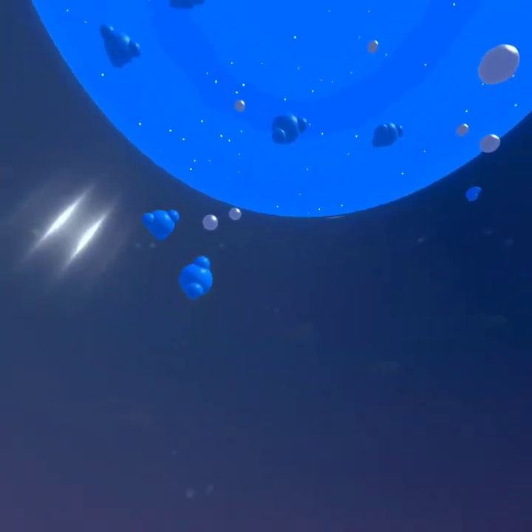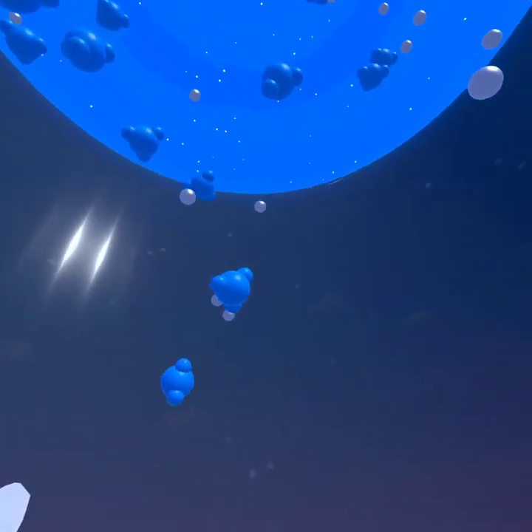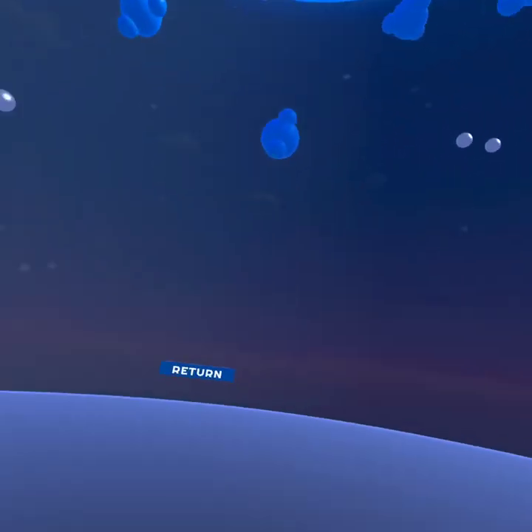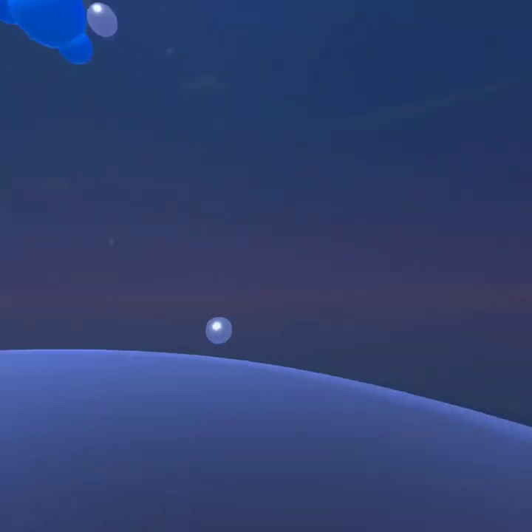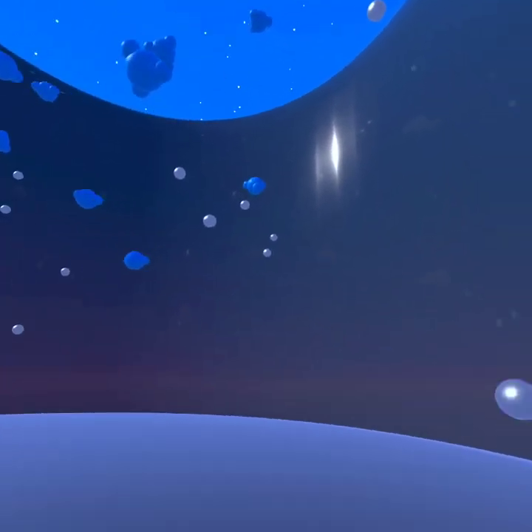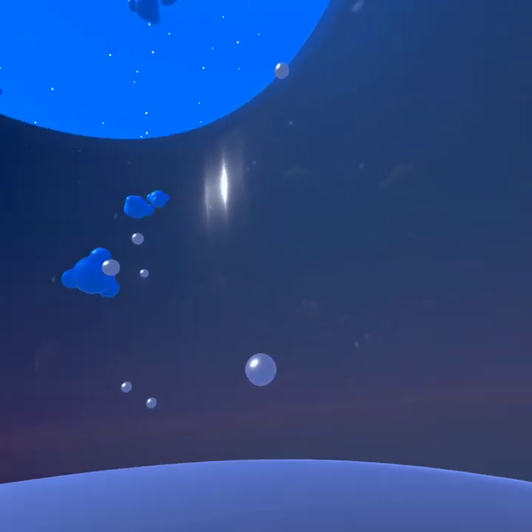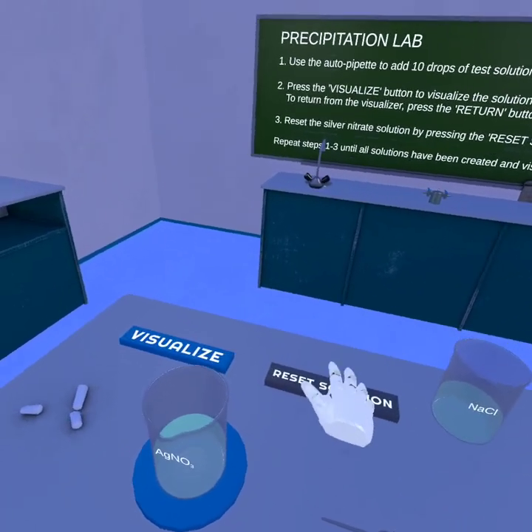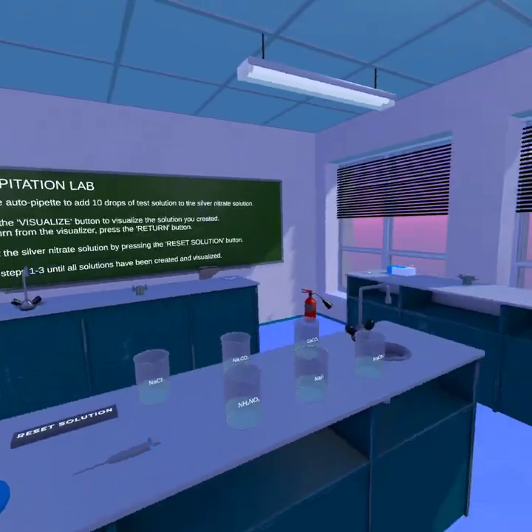So we have our silvers, and it looks like the texture on this has not been updated to the new one. That's like a 5-second fix. But yes, so assume these are the old nitrates, the ones that we saw in the beginning. But it's all the same thing, as if it were the original compound. It was the original solution. It's the same thing because it hasn't gone in.